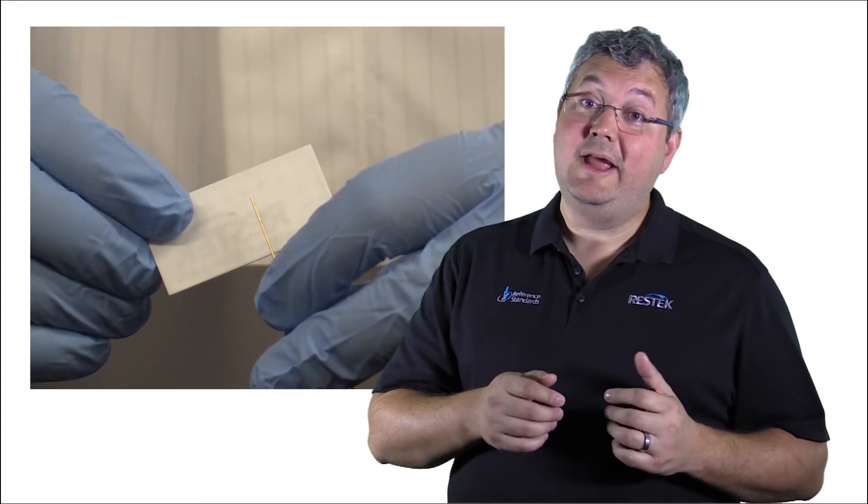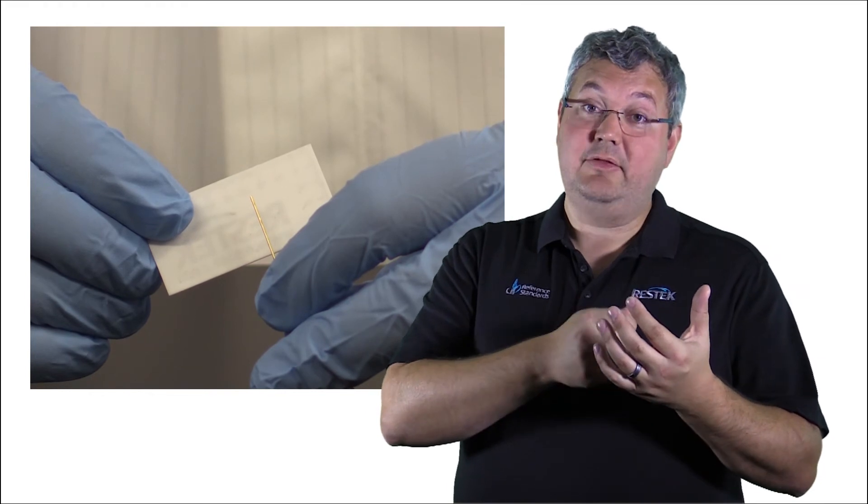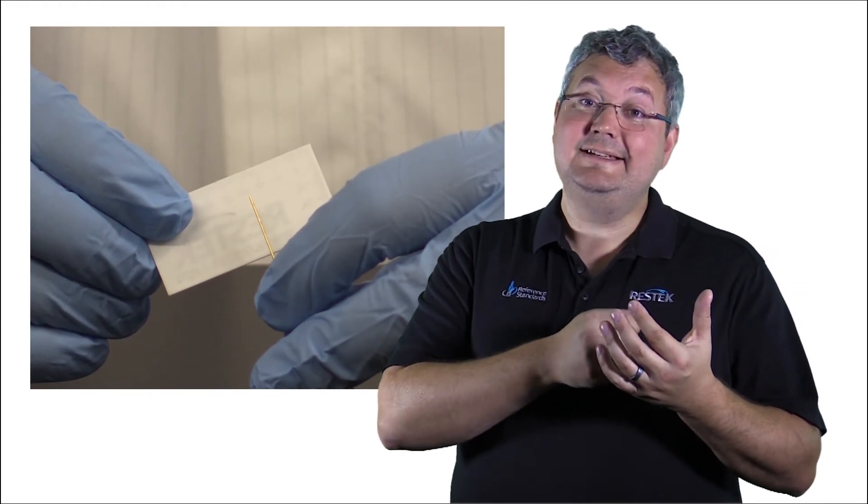Or, if your eyes happen to be a little bit better than mine, you can probably get away with holding the column up against the back of the scoring wafer, and there usually is enough contrast for you to tell if you have a nice square cut.